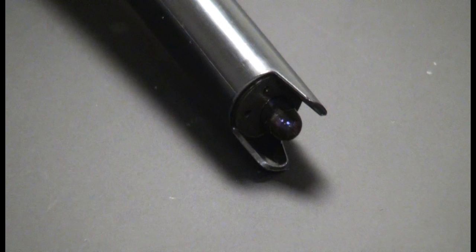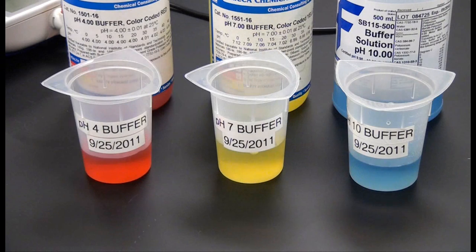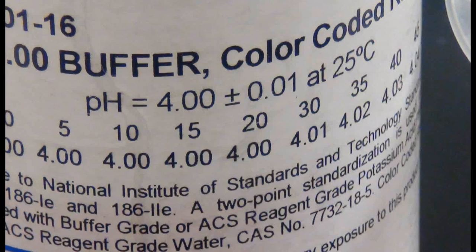This electrode contains a temperature sensor and auto-corrects for temperature variation. However, calibration buffers and liquid samples should fall between 20 and 25 degrees centigrade for the most accurate results.